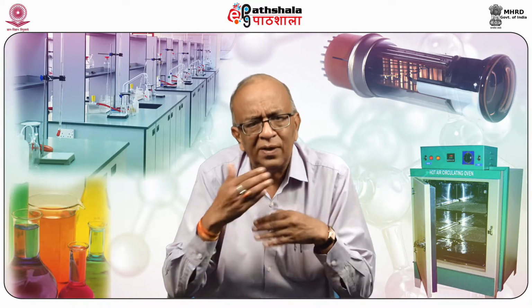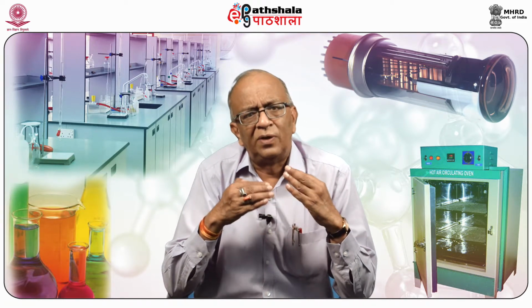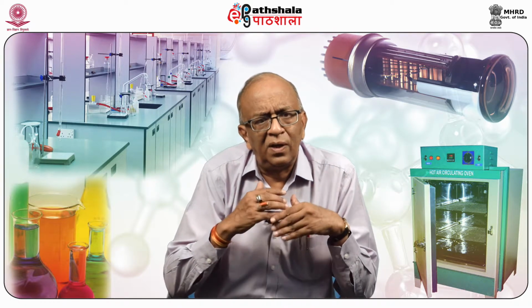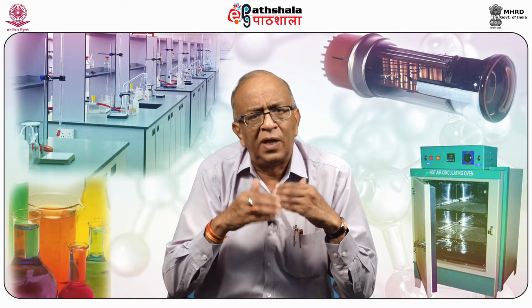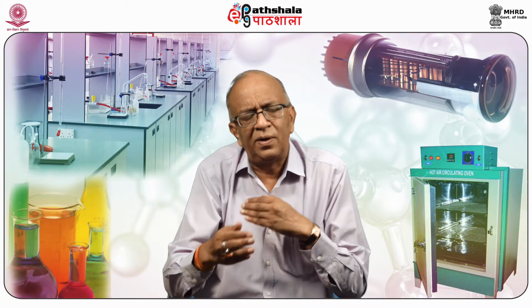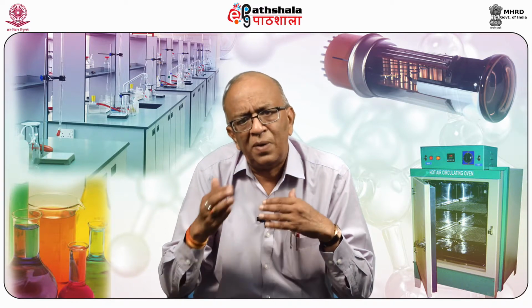Another will be thermometric titrimetry, a type of titration, and here again a calorimeter will be used for the measurement.